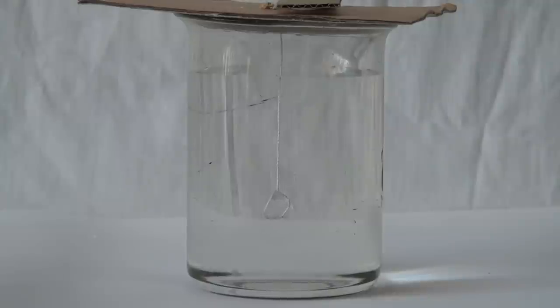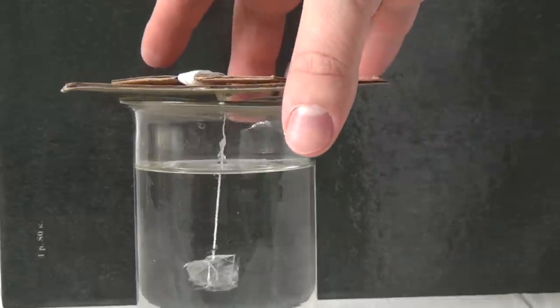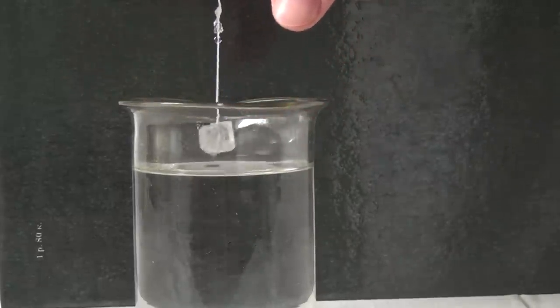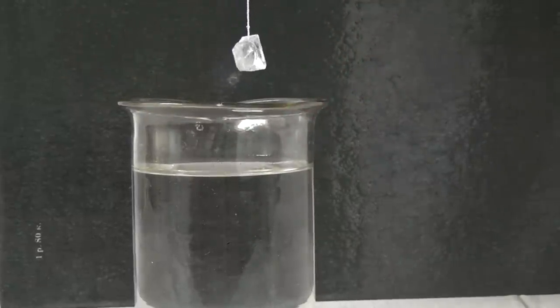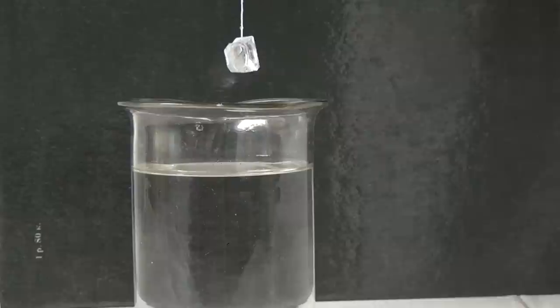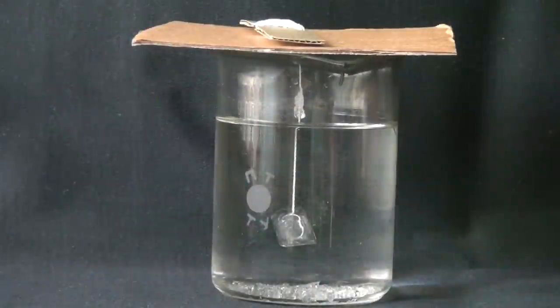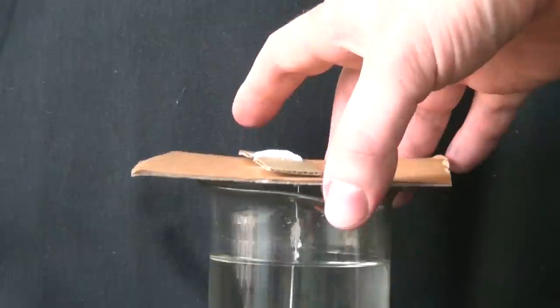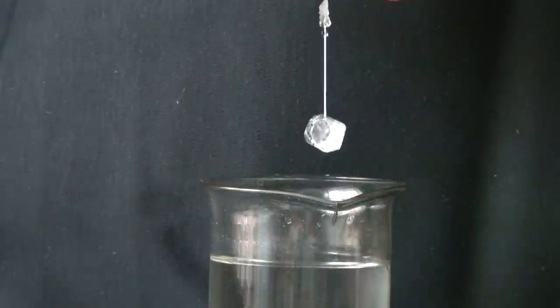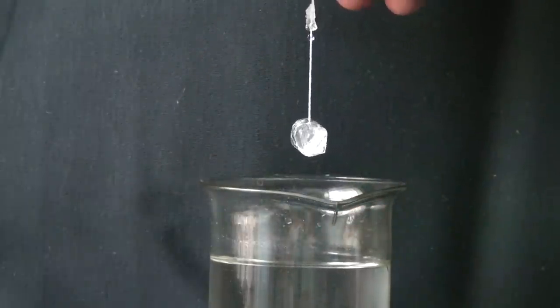Over the time of growth of the crystal, it will become bigger and bigger. This occurs because the water from the solution will gradually evaporate, thereby increasing the concentration of the solution. Since we have a solubility curve, we can learn that the excess material that cannot be dissolved must go somewhere. And this is the substance that forms our single crystal.